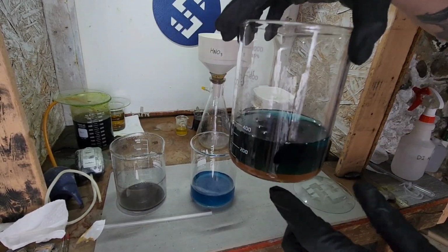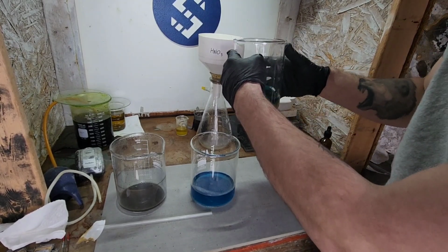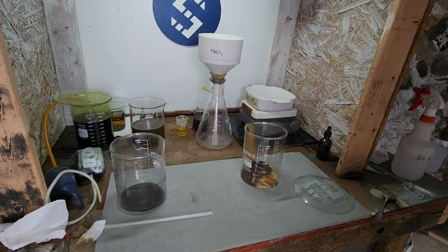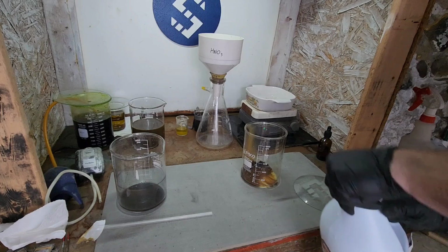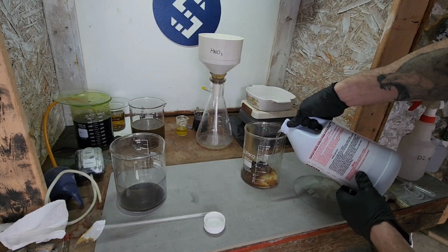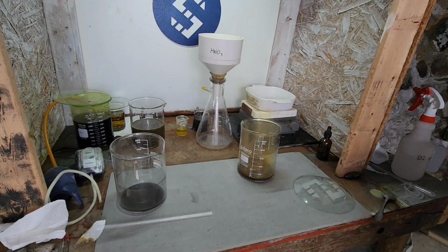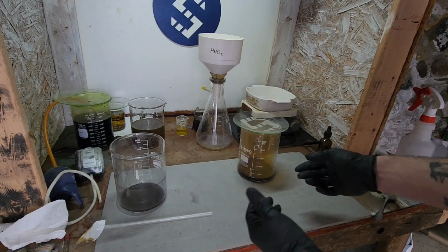Alright, let's continue dropping some of this stuff. This is the bigs here. And we got some fun stuff to deal with. See if we can pick some of that stuff up. There we go. So before we go ahead and put anything in there, we're going to try a little sulfuric acid with this because there is a little iron in there. I want to see if we can help that rust out a little bit. So I got about 100 mils of sulfuric in there. We got nitrates left over, so that's going to kick off with making basically poor man's nitric right off the bat.